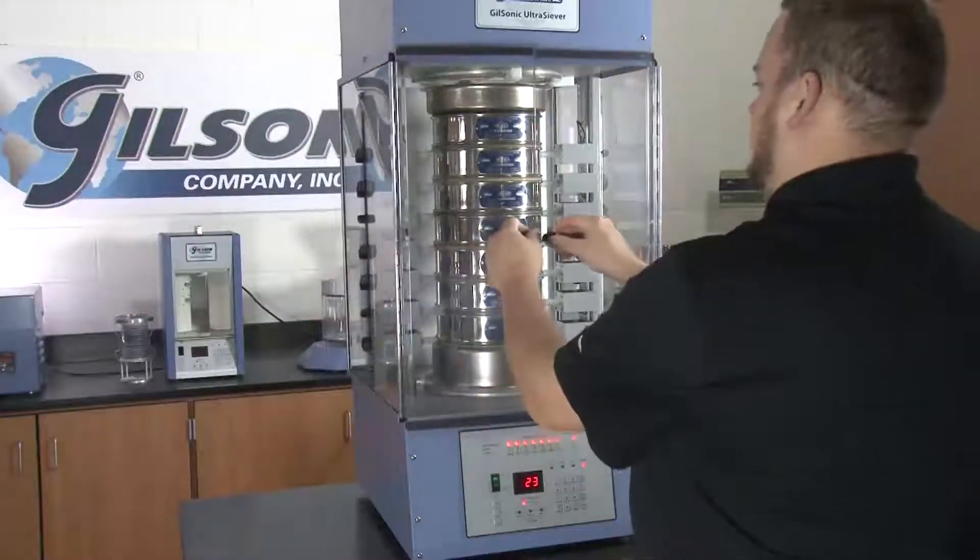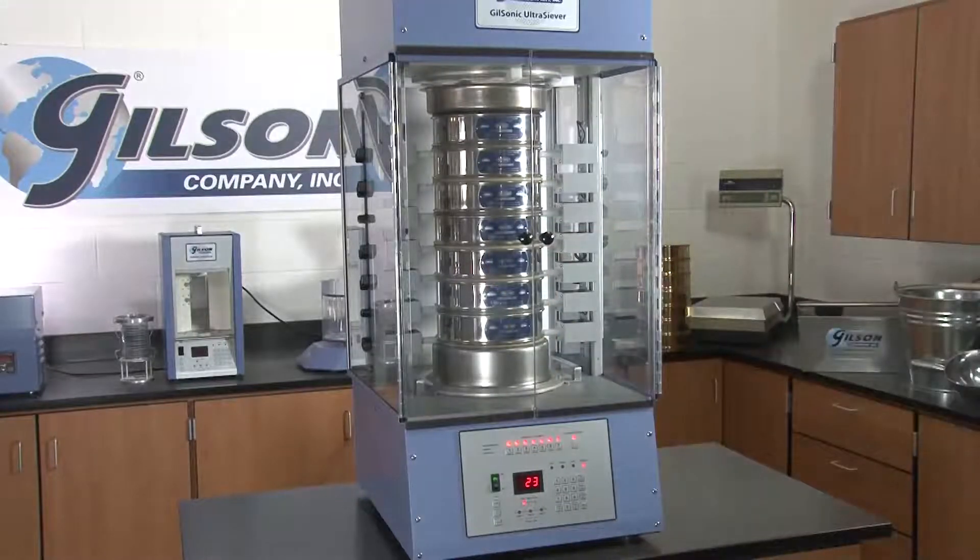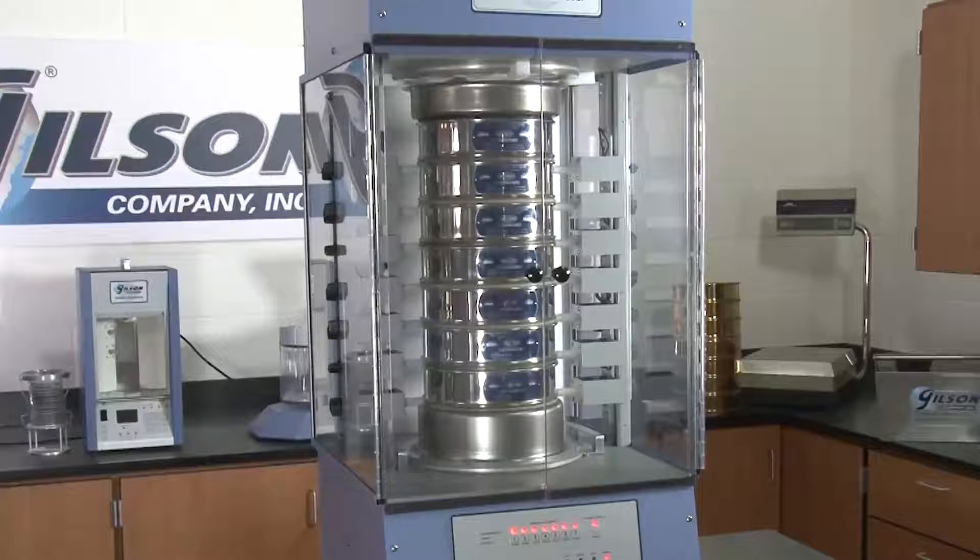The clear Lexan full-width doors enclose the testing chamber to contain airborne particles, protect lab personnel from dust inhalation, and make cleanup easier.